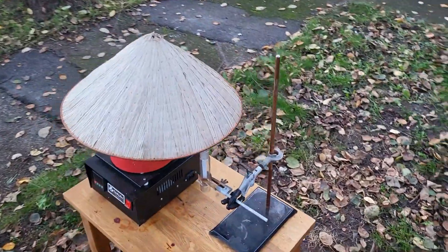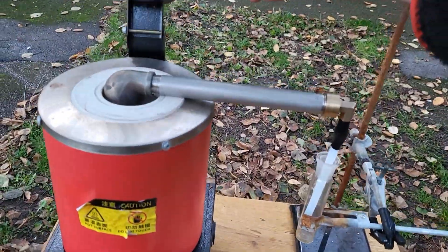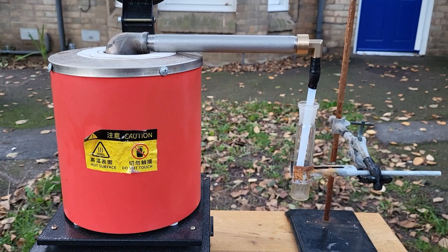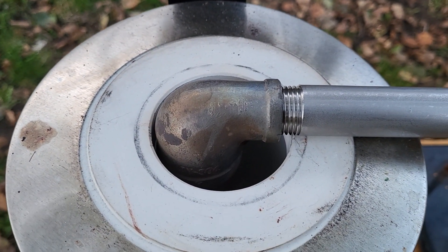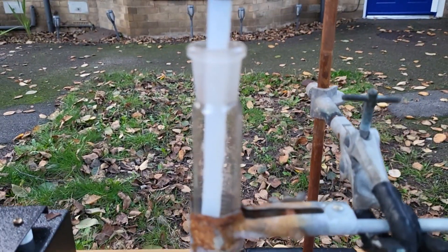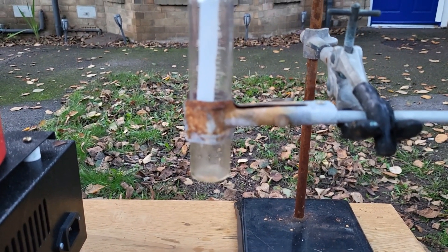I'm quite proud of this contraption. The potassium chloride and calcium will react in the crucible. The potassium, once it's been generated, will distil over. Hopefully it won't react with the PTFE, and then it will be led into some mineral oil. The temperature has to be something like 758 degrees.